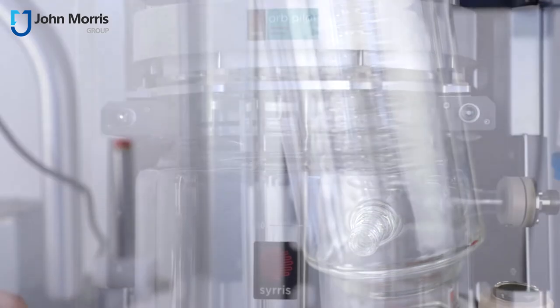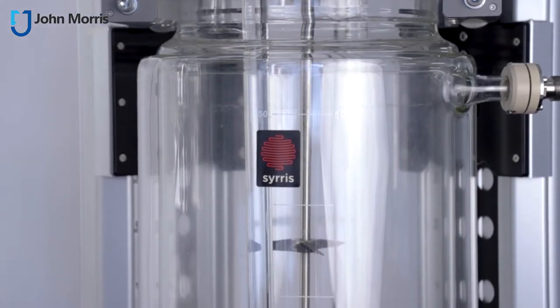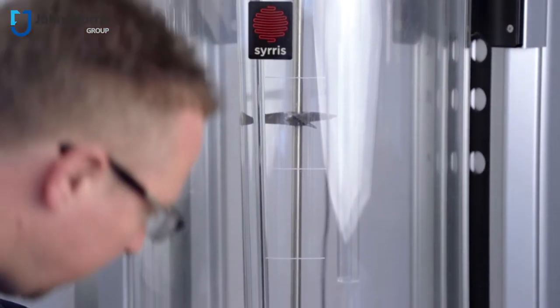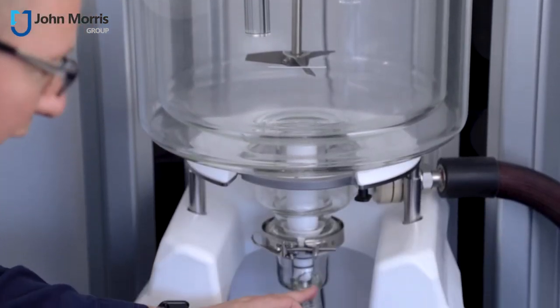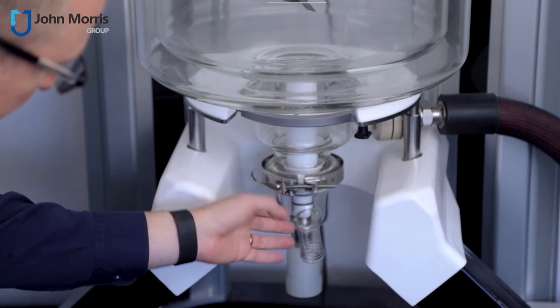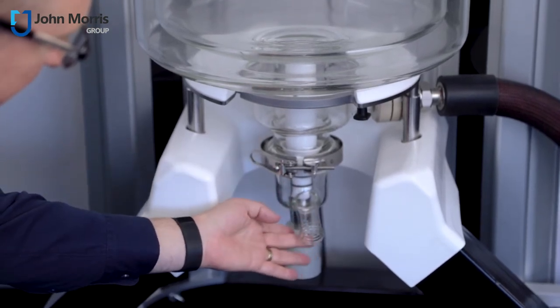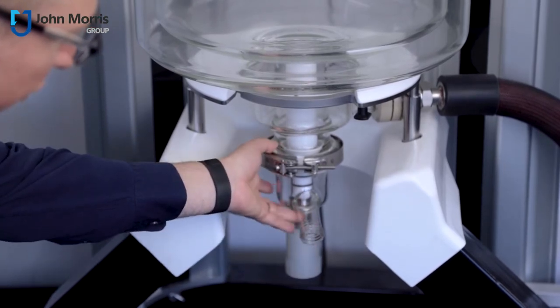Cirrus spoke to a range of pharmaceutical manufacturers to find out what the most common complaints they had were about their reactors in their facilities. And one of the things that they came up with was the fact that the easiest point to break is the drain port right here or the harvesting port. And so what Cirrus have done is they've actually made this whole harvesting port a separate product and if you break one you can just simply join another one directly up to the bottom.